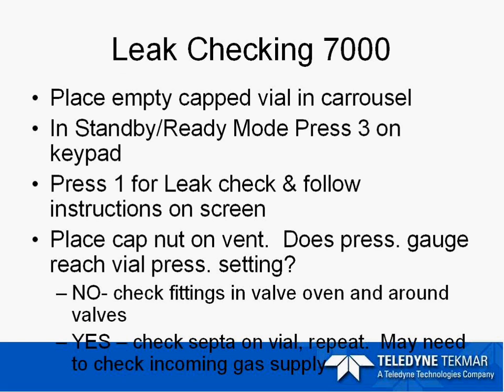When we leak check the 7000, we are going to place an empty capped vial into the carousel, press 3 on the keypad, and press 1 for leak check. There are on-screen instructions that tell you what to check. We are also going to place a cap nut on the vent valve head on the rear of the unit. Does the pressurized gauge reach the vial pressurization setting? If not, the most common place for checking for leaks is in the valve oven area, around the six-port valve, the fittings, the needles, and around the pressurized and vent valve. If the pressure gauge does reach the vial pressurization setting, that usually indicates a very poor seal with the septum on the vial — maybe the cap is not crimped correctly, so you may want to repeat the process with another new crimped vial.